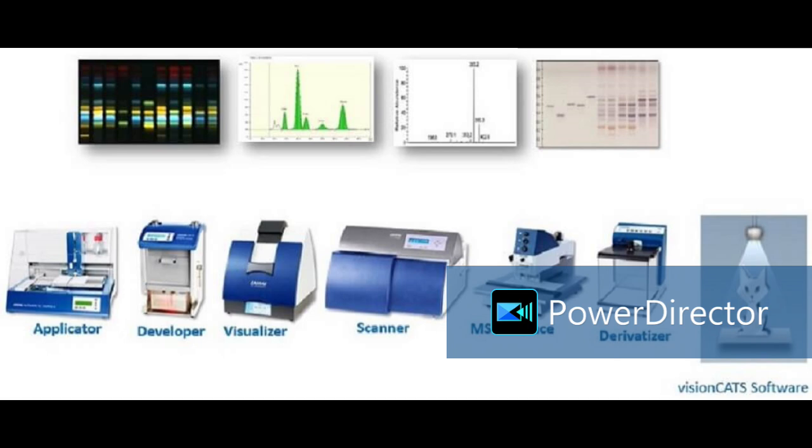So in each sample these three are detected. Intensity is sometimes higher, sometimes lesser. That depends on the variation of that amount in your sample. Intensity is less or high because of amount and sample nature. Okay.